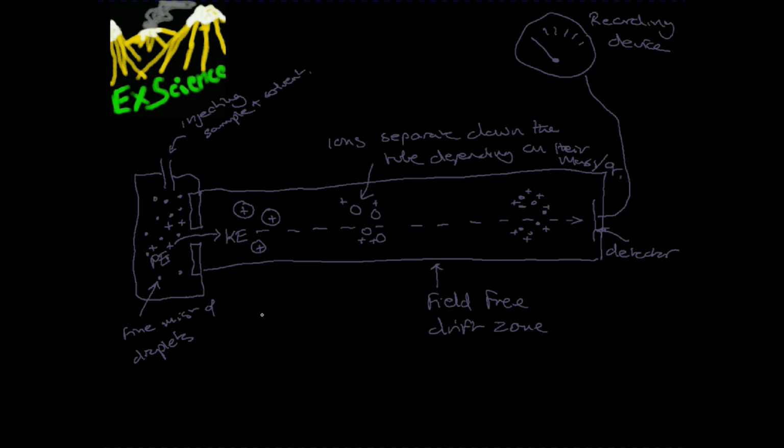Typically, a pulse of ions will be generated, and the time taken for each size of ion to reach the detector will be recorded. Then the process is repeated until a spectrum is built up. So it's a spectrum of the contents of the ionisation chamber. So that's a summary of how time-of-flight mass spectrometry, especially with electrospray ionisation, works.